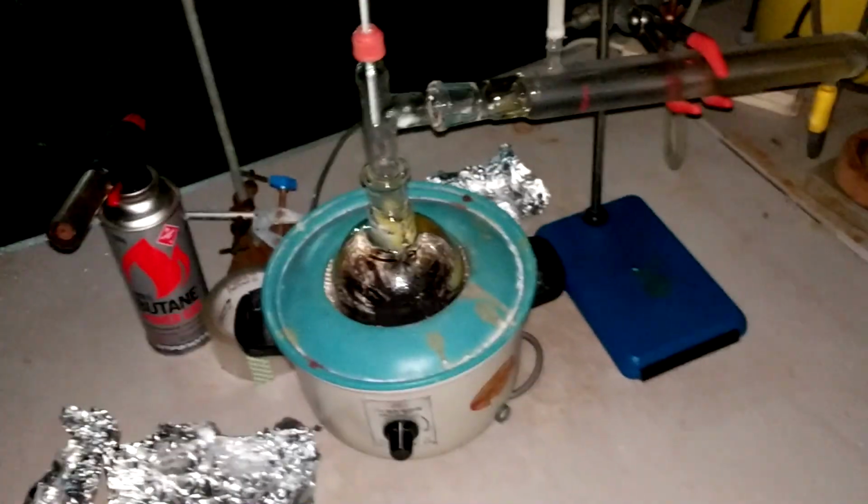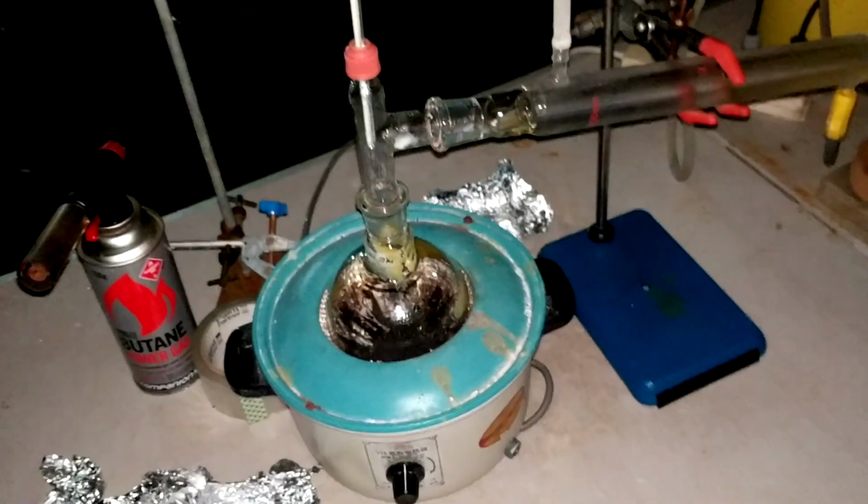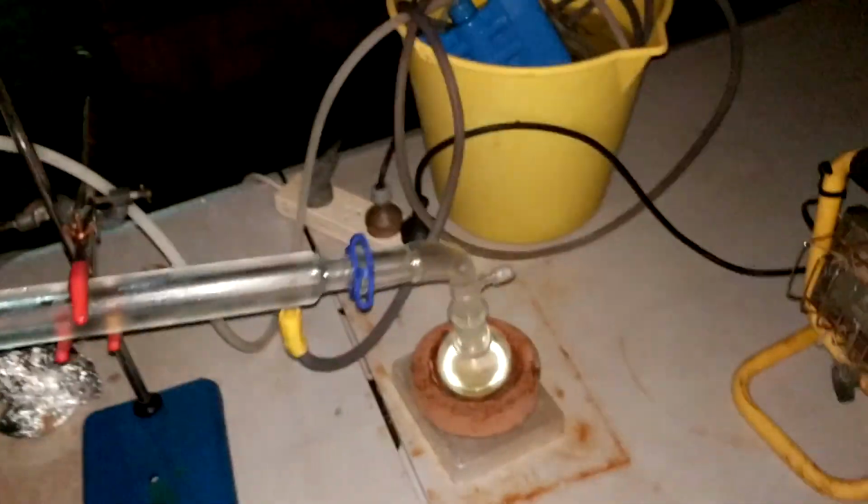And I'm using the gas mask. I haven't actually mentioned that much, but not just because it smells awful, but because pyridine really isn't very healthy to breathe. Whenever I'm not having to talk on camera, I've been breathing through the gas mask, so I really haven't been exposed hardly at all to the pyridine. Hopefully I can continue that.